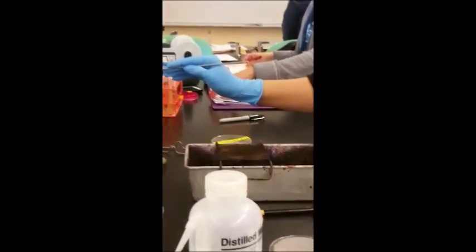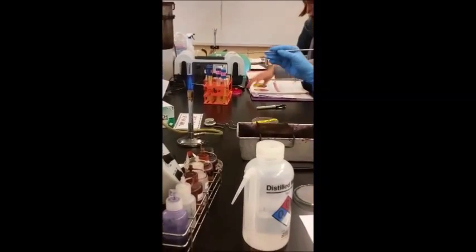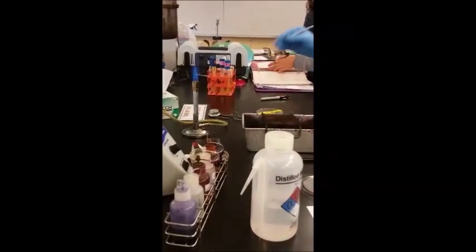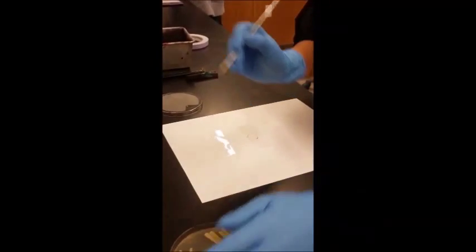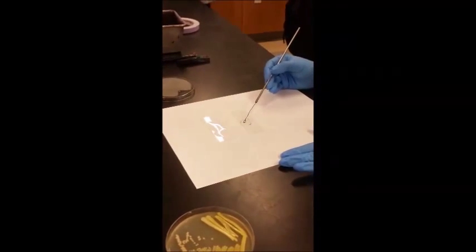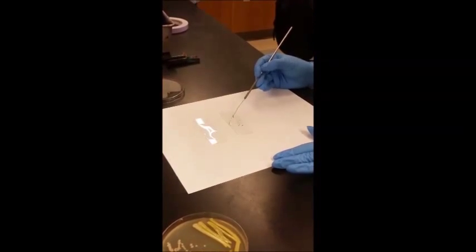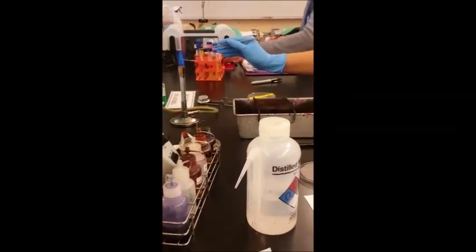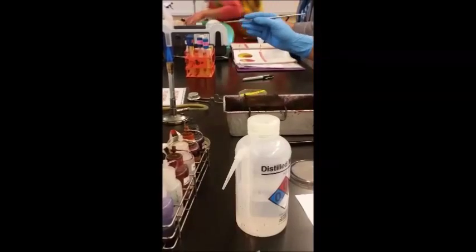And then we try to heat the loop for just a few seconds and try to cool it down, as you see in the video. It's cooled down already. And then now we just take a little bit of water and drop it onto the slide. Very smooth. And then again we have to heat the loop and let it cool down for just a minute or less than a minute.